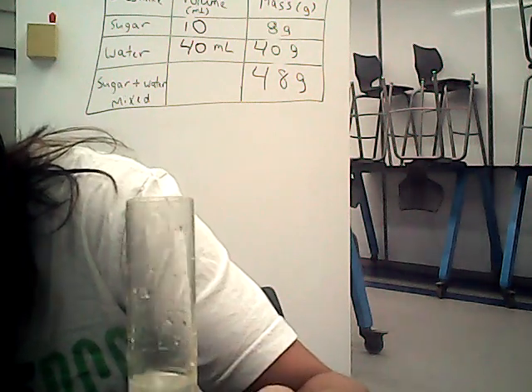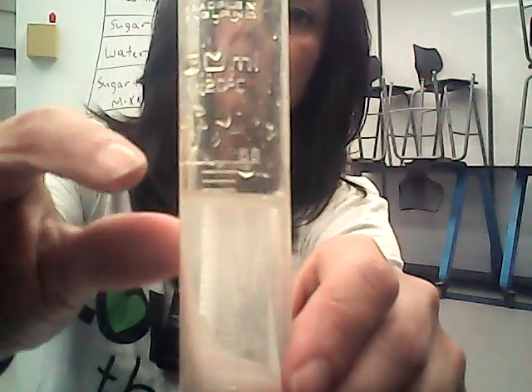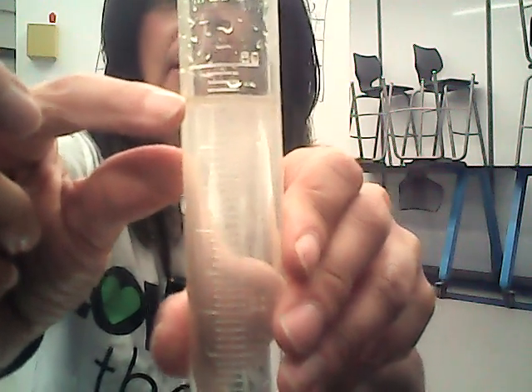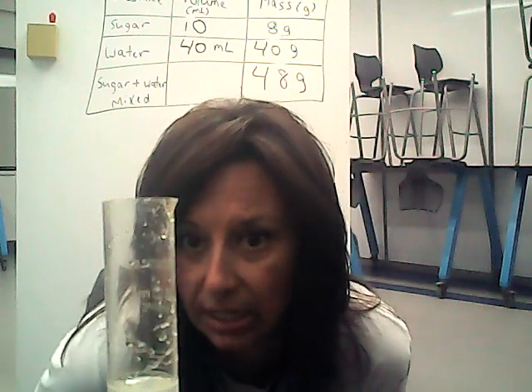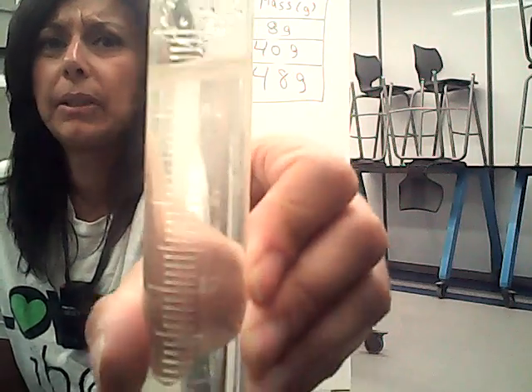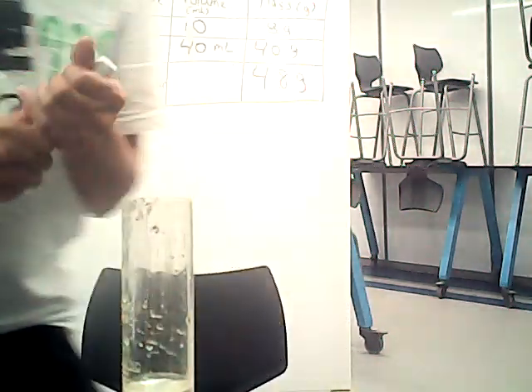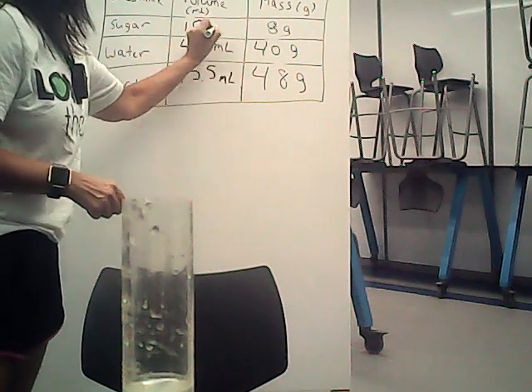What about volume? Let's take a look at the volume. It's kind of hard to see, but here's the 50 mark right there, and we can see that it is not 50. I would say it is about 45 and a half milliliters. About 45.5 milliliters when I level it and read it.